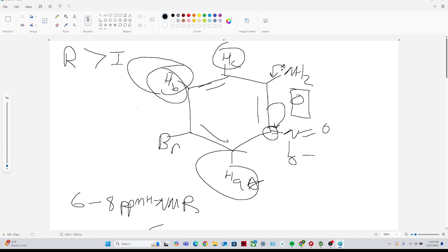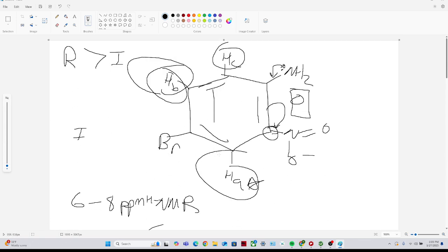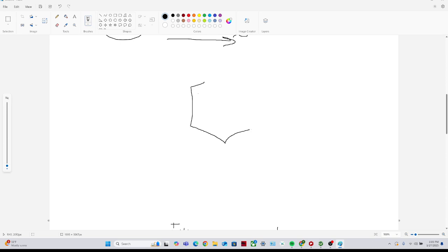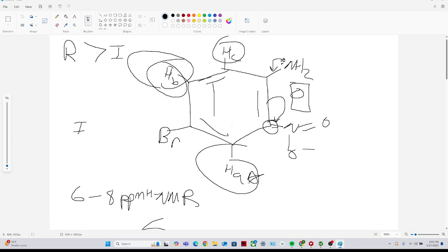And so the next thing that you should go to is typically induction. And this is only strictly speaking for chemical shifts. If you can explain something through chemical shift, great. If you can't, then there's something else that you should go to, and I'll explain that in a second for this particular issue. So when I go to induction, I'm going to redraw everything for the sake of being organized. This time I'm just going to draw it as a ring like that. I just want to mimic it.